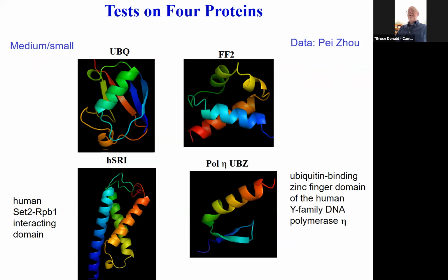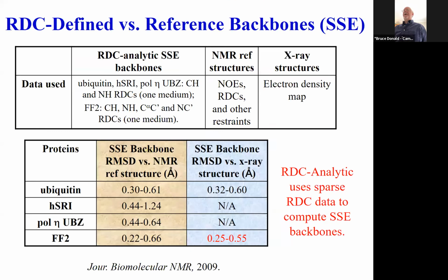Okay, so let's look at just a few examples, especially for the experimentalists, and I'll try to leave 15 minutes per question. This has been tried on a number of proteins, both known and unknown. Let's look at some of the data, how this looks, how's the result, and give you an idea of this. You might use different data for this, like some NOEs, RDCs, and so forth, what we're comparing to. And then what kind of accuracy do we get?